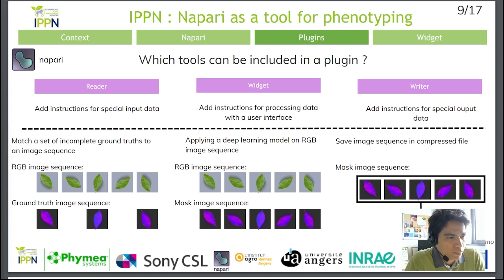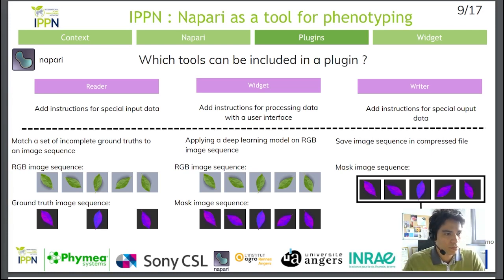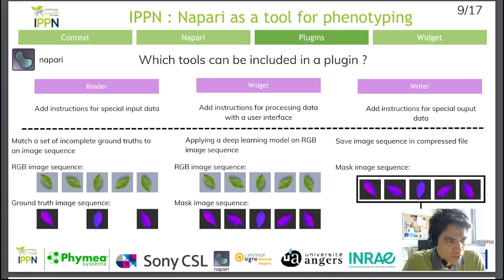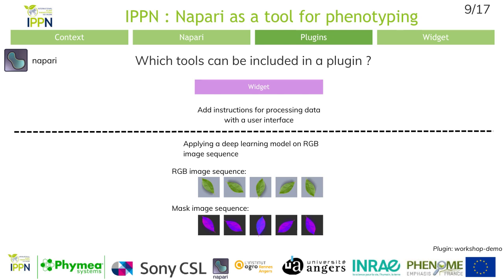For the Widget, a user can propose an image processing method. This method can be conventional or use a deep learning model, and present the method in a widget that appears in the Napari window. As a widget tool, a user can, for example, suggest a leaf segmentation method to complete the mask dataset from our previous example.